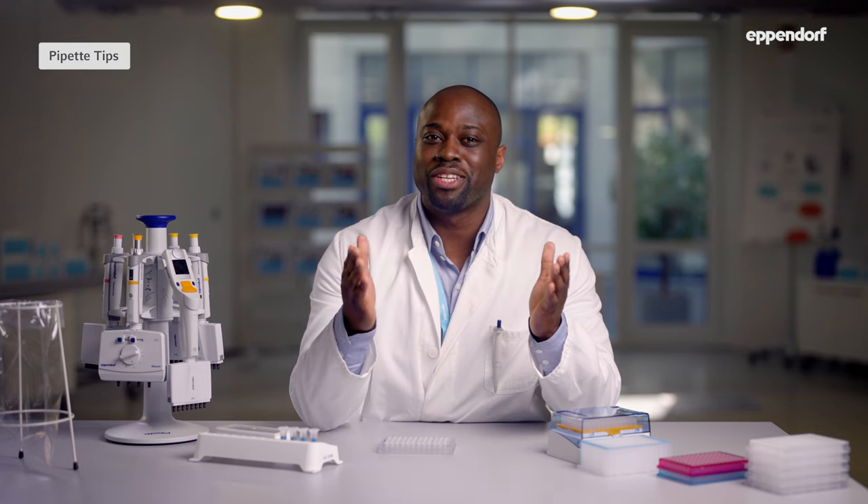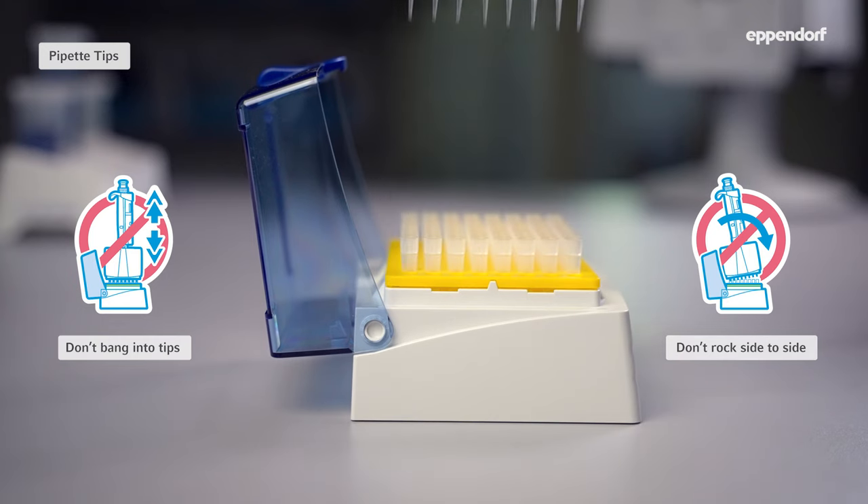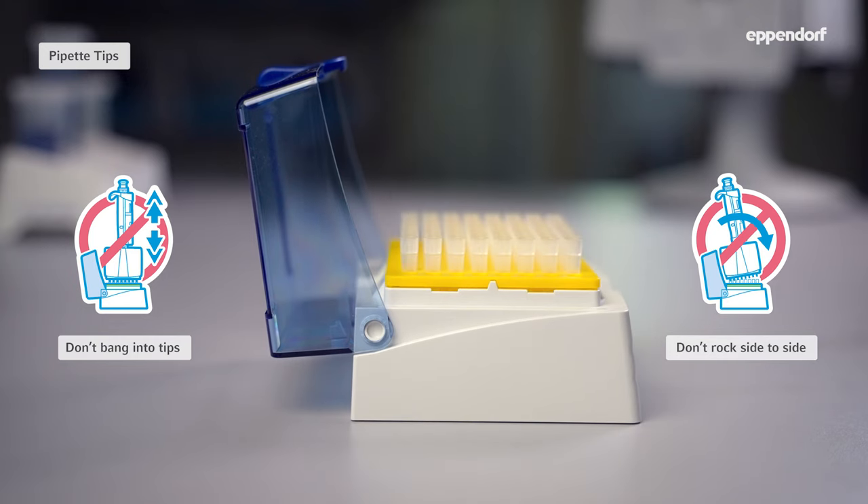But how do we pick up the tips? With the right tips, filling your multi-channel pipette is just as easy as with a single channel. Step one: hold the pipette cones straight above a row or column of tips and pick them up just like you would with a single channel pipette. Push the pipette straight down into the tips and apply even gentle pressure until you receive haptic feedback.